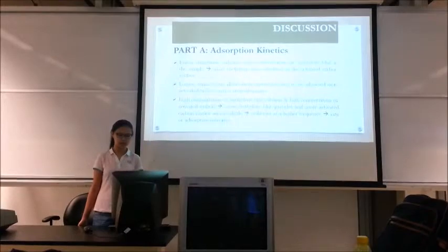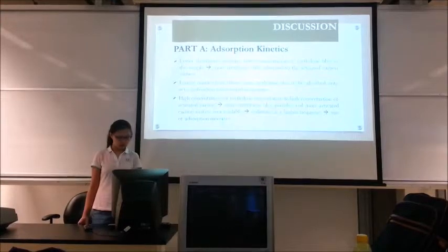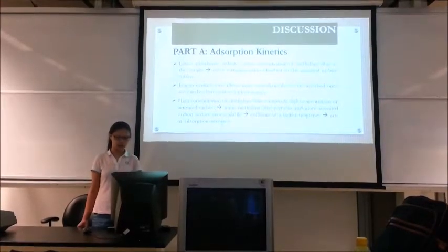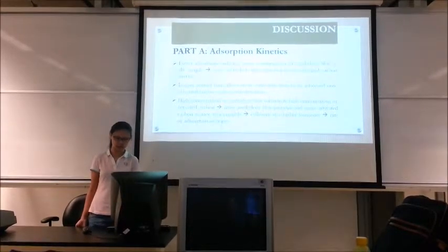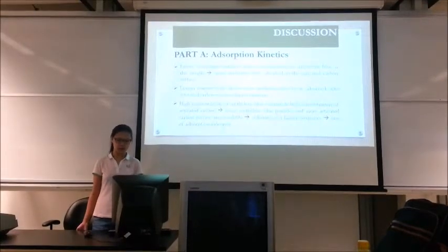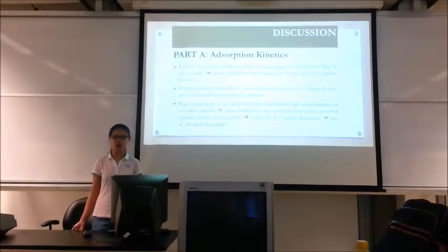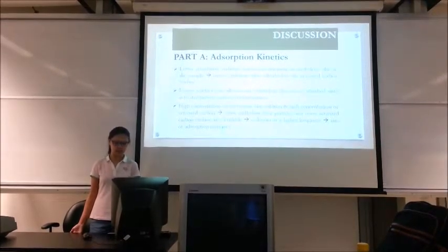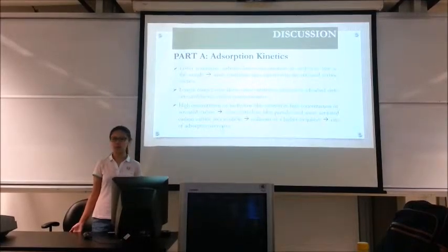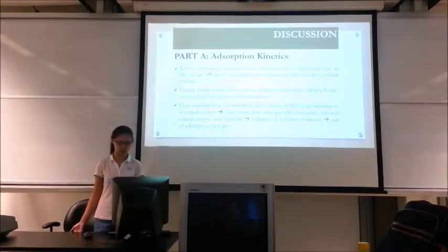The lower absorbance indicates a lower concentration of methylene blue in the sample. It also means more methylene blue is absorbed onto the surface of the activated carbon when the absorbance is low. Generally, when we leave the activated carbon in the methylene blue solution for a longer time, the contact time between the adsorbent and the adsorbate is longer, so more methylene blue is supposed to be absorbed by the activated carbon until it is saturated. However, from our results, the absorbance fluctuates. This might be due to errors or contamination while taking the samples from the solution.